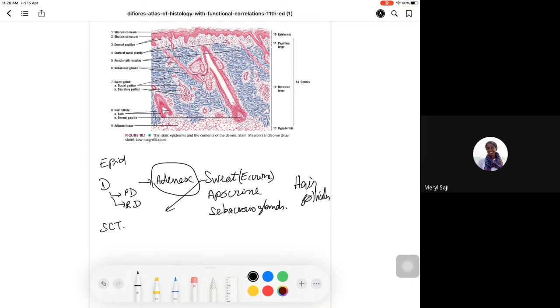Sweat gland. Both the tubular and glandular structures will be the same, but they are usually arranged in lobules. And these sweat glands secrete, and the duct will go up and then open into the epidermis. This is the connection of the sweat gland, and they are lined by low cuboidal cells. Whenever there is a tumor with attempted duct formation, then we have to think of eccrine glands.